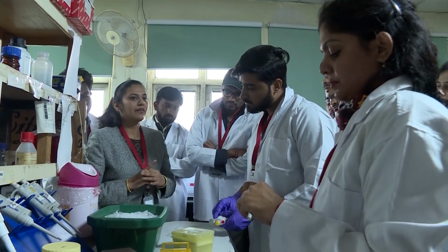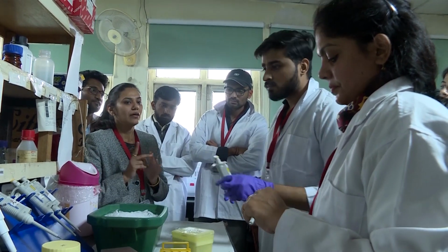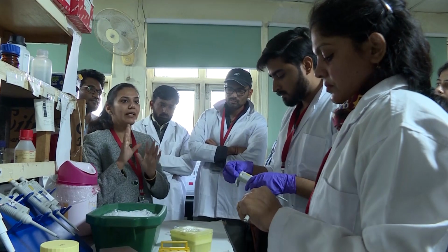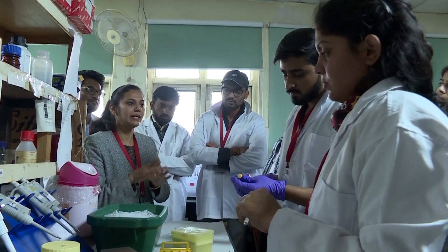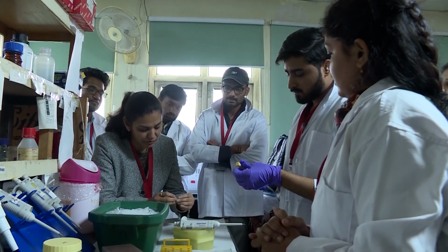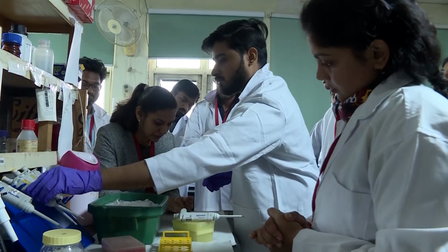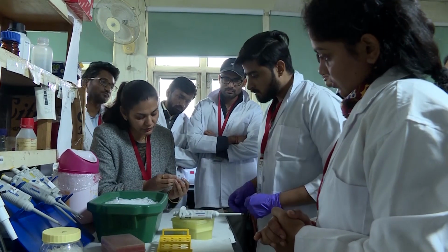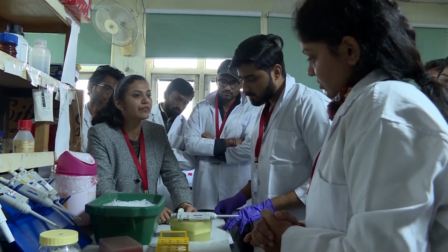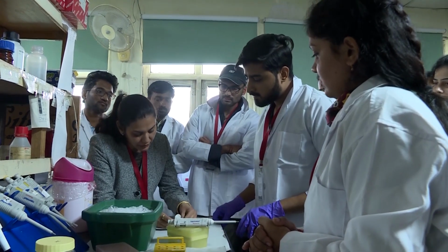Now see, we have forward primer and reverse primer of two different kinds of gene. One sample from control and one sample from the treated have the actin gene primer, forward and reverse, and another has MAP kinase. Okay, so here we keep it like this. This is your actin control, and this is your actin heat stress. So in these two tubes we will add actin primer, and in these tubes we will add MAP kinase primer. This is heat stress, this is control.